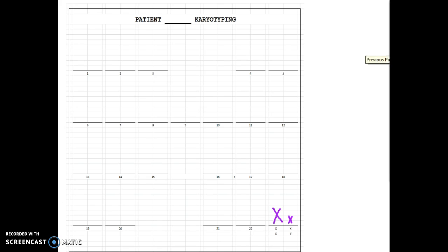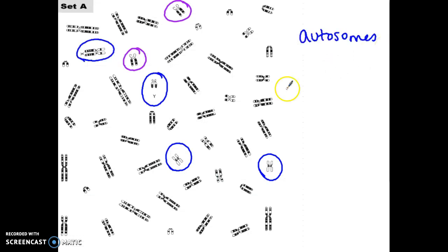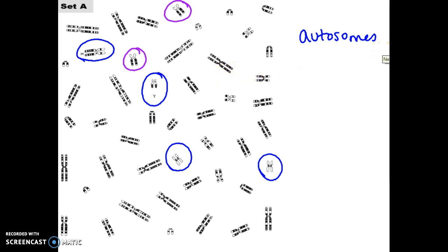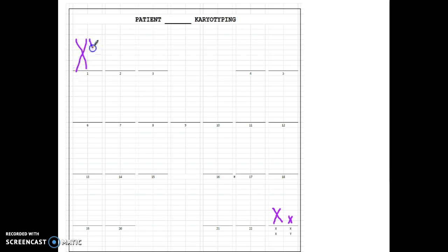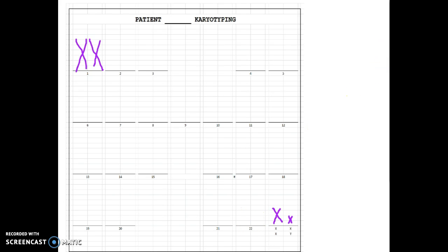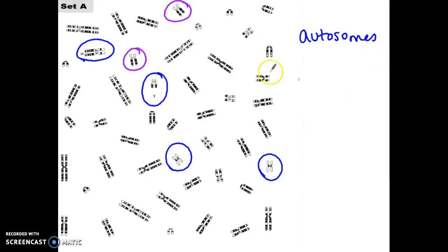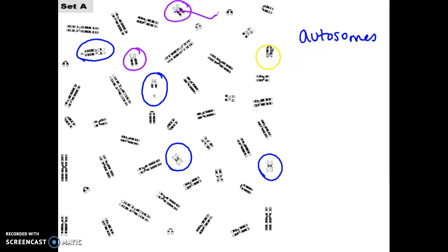So what you then do is you start going through and matching these chromosomes up. You probably have to match all of them before you can start gluing them down, but you put them in size order. Your largest chromosomes would be paired up right next to each other, right up here. And your smallest would be all the way down here. Now, notice that some of these chromosomes have an X shape, but others have more of a U shape or kind of horseshoe shape.